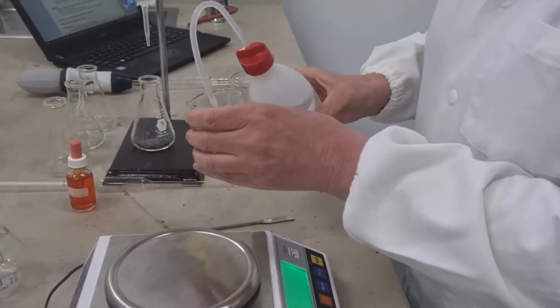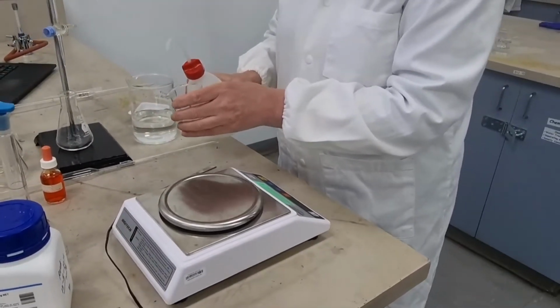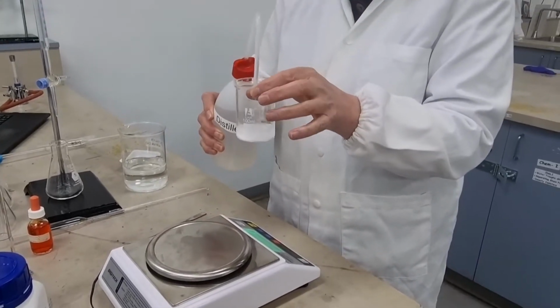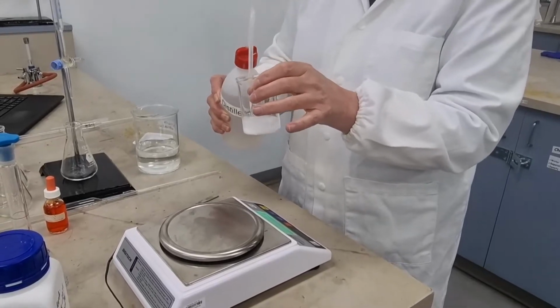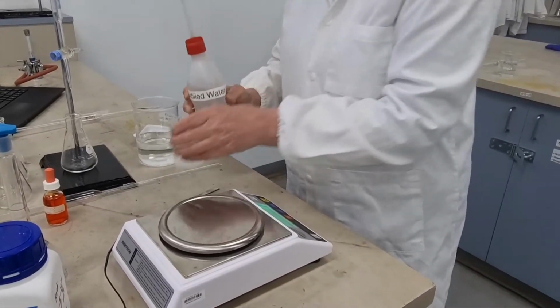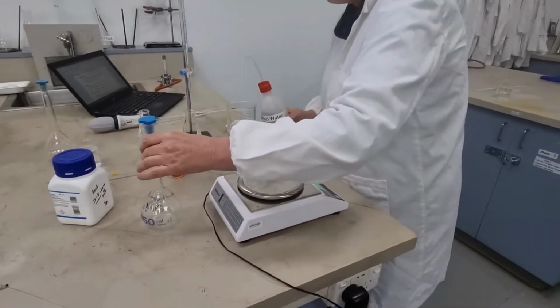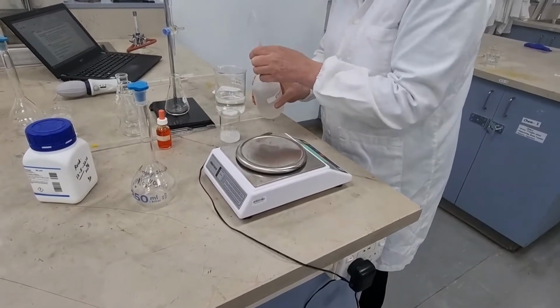Dissolve this. So we're going to make it up in 250 mils, and we're not using this because this is not very accurate, the beaker. So we're not putting it in a big beaker. We're not using a measuring cylinder, even though that is more accurate. We're going to use a volumetric flask because that line is the most accurate.